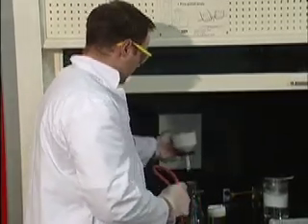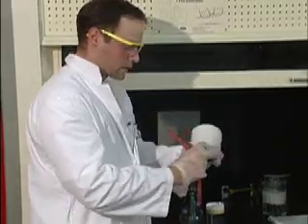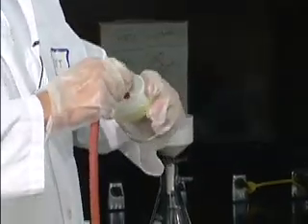Now what you're going to do, make sure that when you put this O-ring on, the flat surface is towards the sidearm flask and the curved surface is towards the Buchner funnel. This here is a trap. Not a trap that you fall into, but a trap that we use so that nothing goes back into the vacuum.